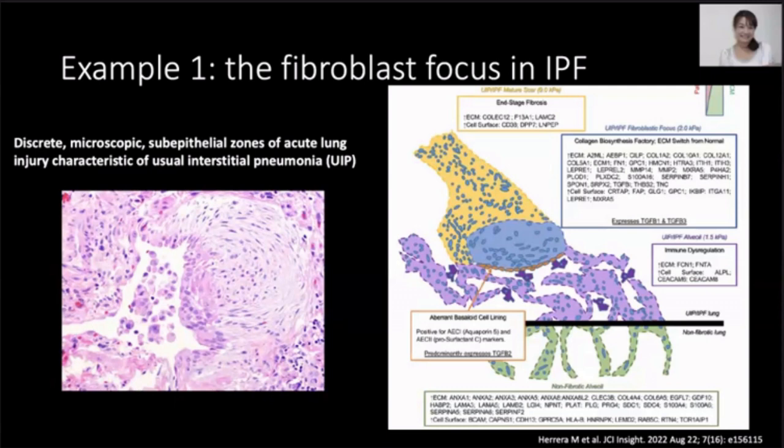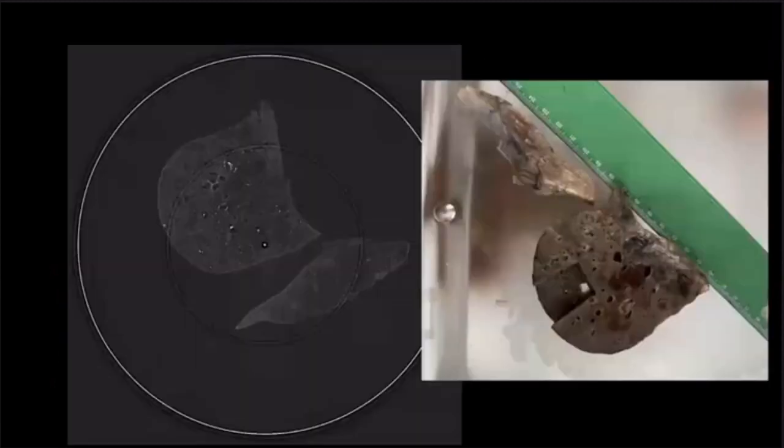And Joe Jacob, together with Ryoko, who did much of the work that I will be showing here, we were able to retrieve a sample of a patient with lung fibrosis, and we made it undergo HiP-CT scanning. And then we align it with what we see when we cut off the specimen. So we take zoom scans, we take an entire overview scan, and then we go into detail. And we were actually looking to find this fibroblast focus in there because the HiP-CT should be able to provide the resolution to discriminate this in more detail.